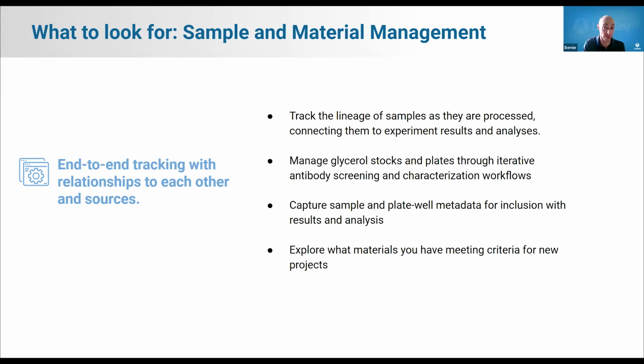What material is in the 3rd or 4th generation plate set? Through the 3rd or 4th iteration, where was it on the last plate set? Once I do my analysis and selection, how do I find the original sequence or clone that was in a different location on a previous plate? These sorts of unfun questions are functions of sample management.